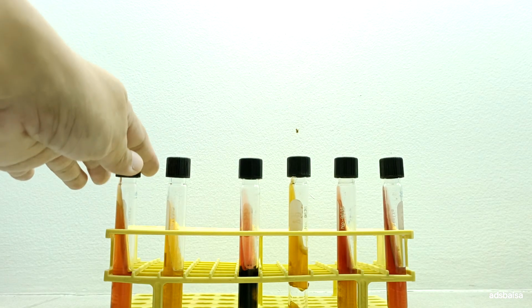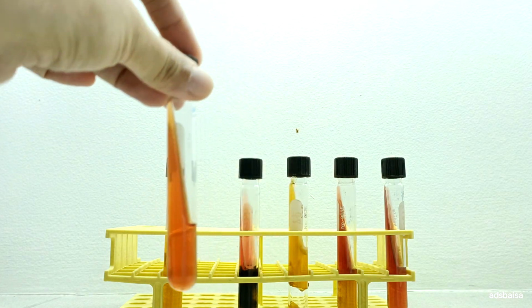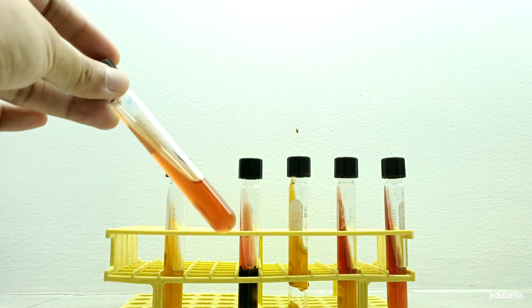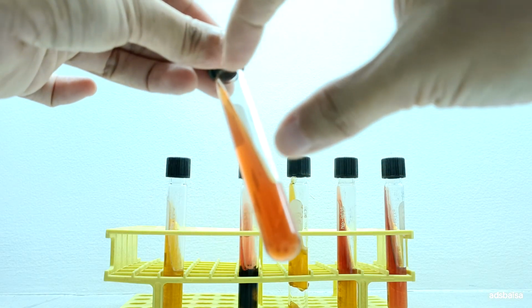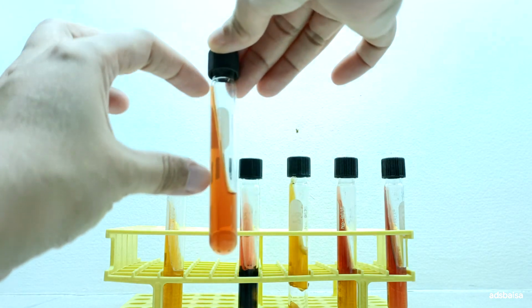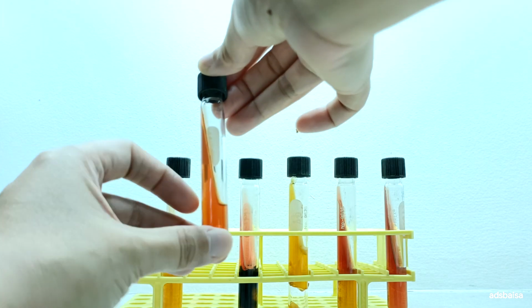So this one is our negative control. This is an uninoculated TSI agar. And we have the slant part. This one is the slant part. And this one is what we call the butt part.